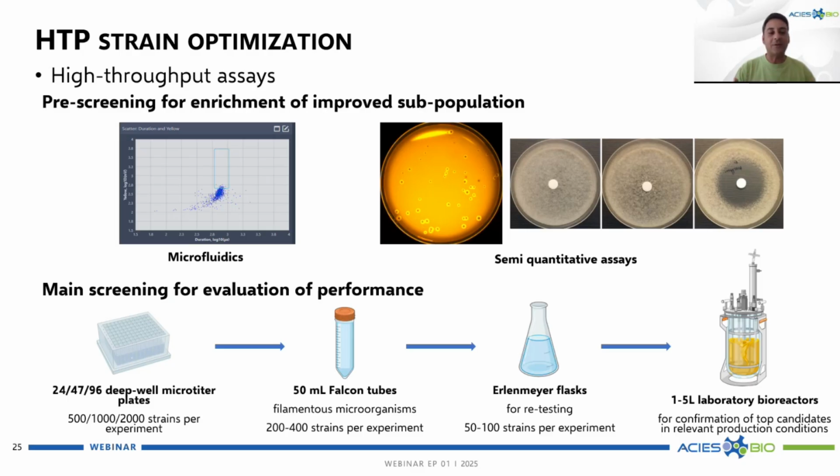And here is where the actual throughput comes in. So we like to help ourselves when possible using pre-screening assays. Consider them like a sieve, which concentrates our effort on testing already enriched populations and not doing it completely randomly, because then you also screen for the lower or average producers, which are not interesting.